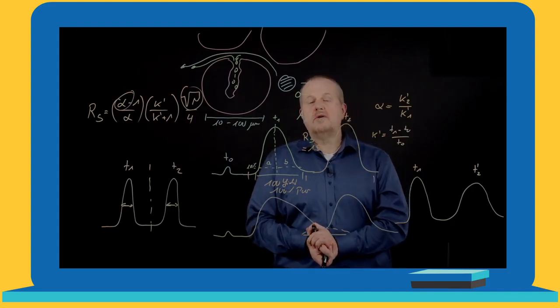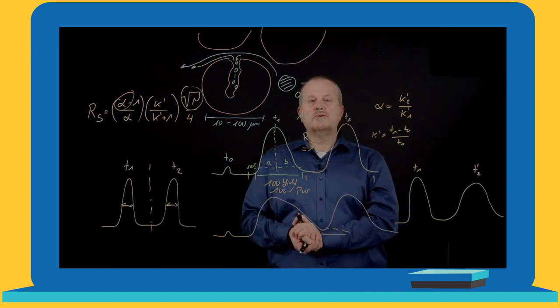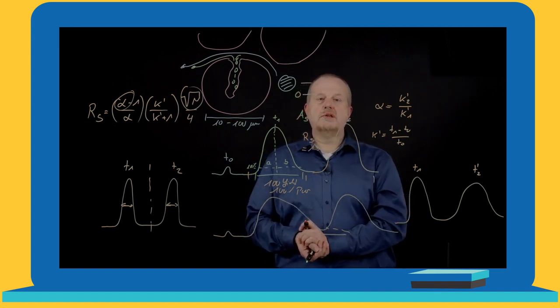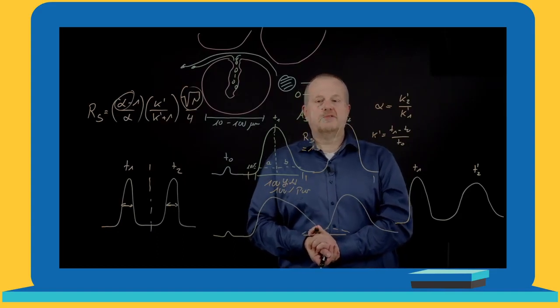And how we put all that into a chromatographic system and into a complete chromatographic separation cycle, we will have a look at in the third part of our video.